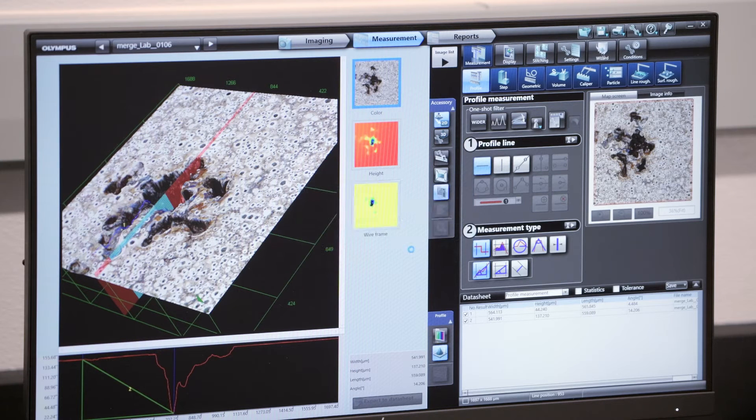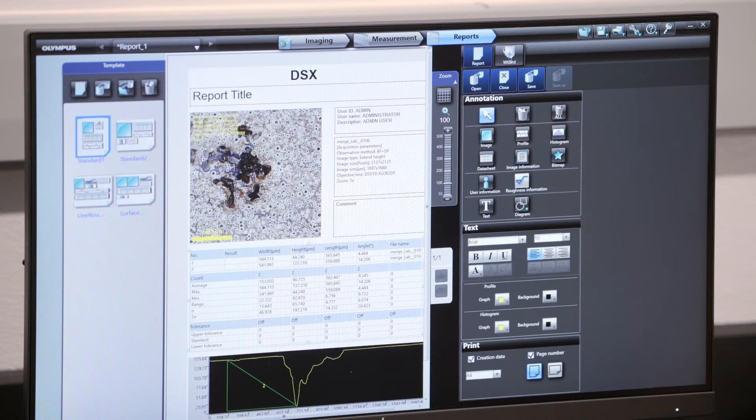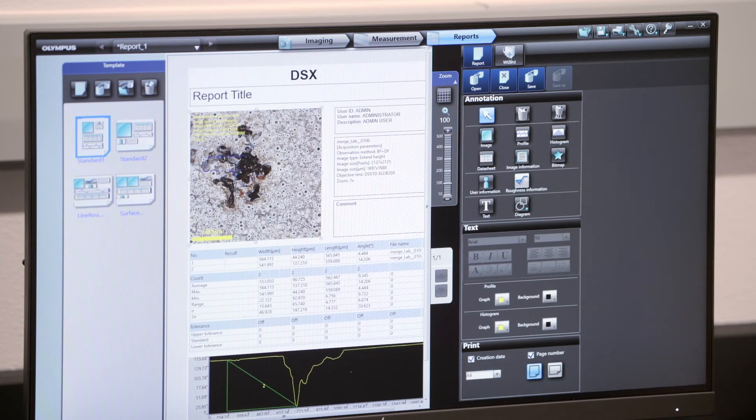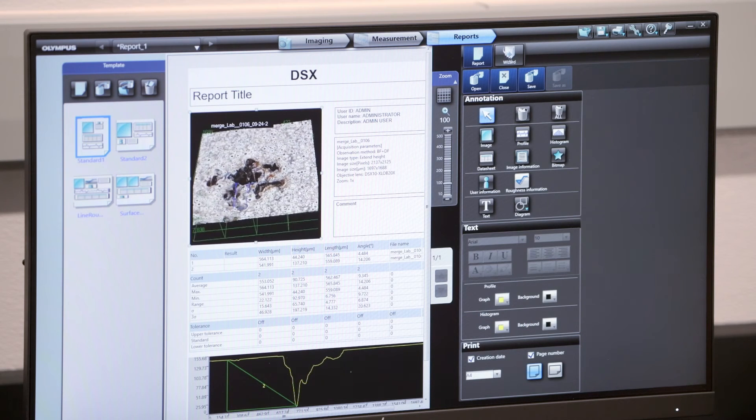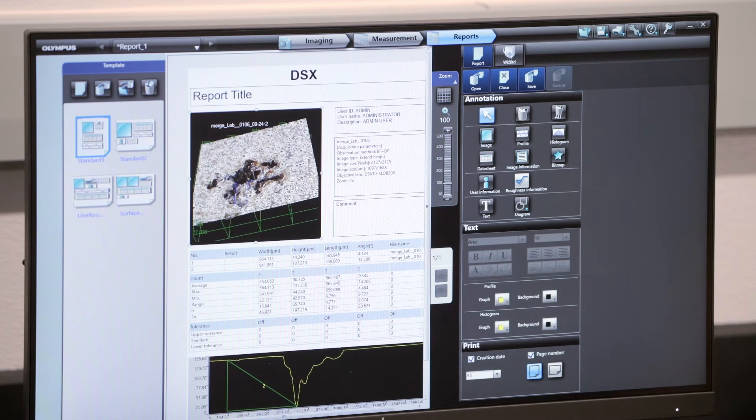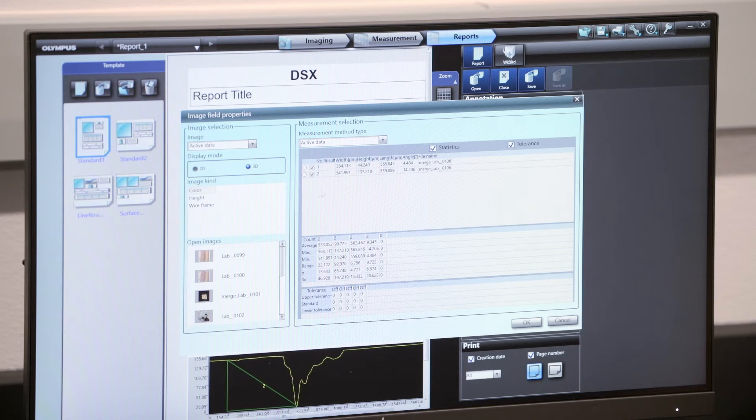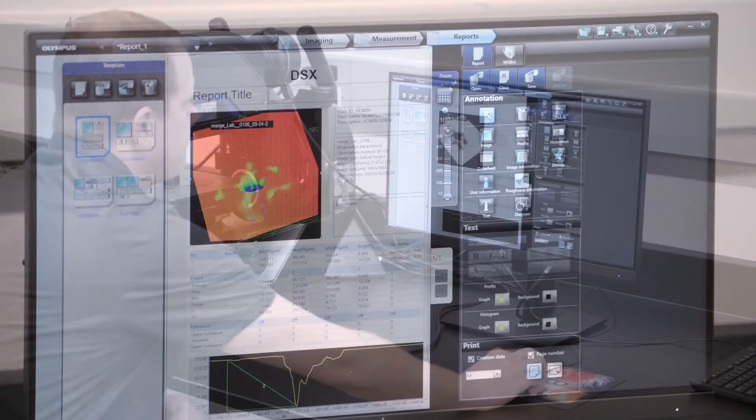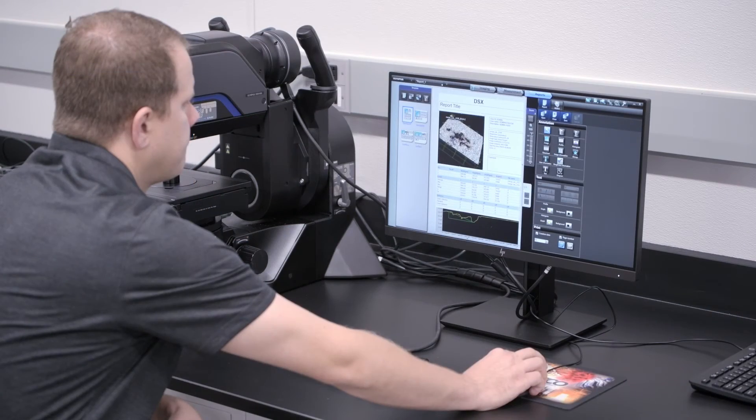The DSX-1000 has built-in reporting software that is highly customizable for your applications and different data display options. Cross-sectional profile data is graphically displayed and relevant statistics are shown in the data table.